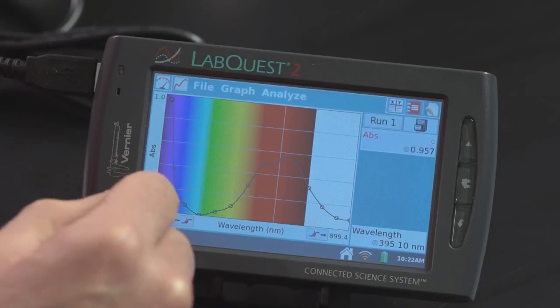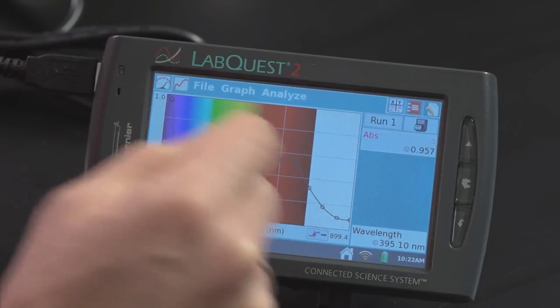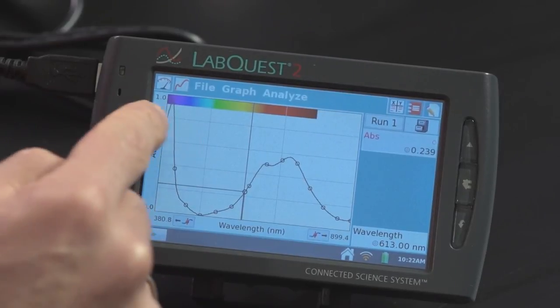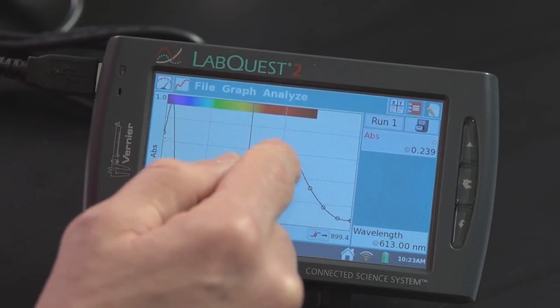And that's a nice absorption spectra. So you can see right here we have a really high absorbance in the purple to blue, and then very little absorbance in the blue to green, and then it increases in the red. Now this may be a little bit difficult to see, so I'm going to show you a little trick to minimize the rainbow background on the LabQuest — by just double-clicking near the top of the graph. Just like that. Now you can see peak absorbance in the blue to violet, very little absorbance here in the blue to green, and then an increase in absorbance here in the red.